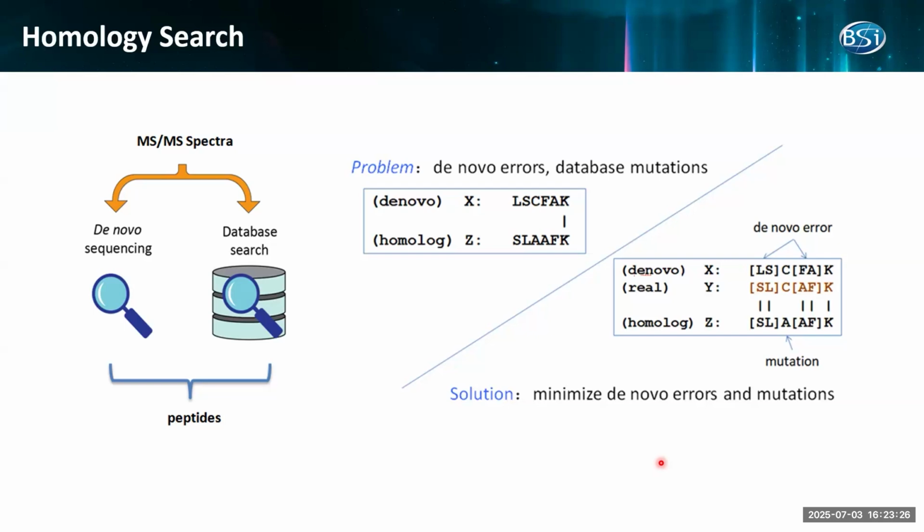Another issue is that DIA is very often very good for low abundant peptides, and now we search the canonical database more than sequence variant databases. In that case, some of the database may not be complete and can miss some information. Now, it's very important and necessary to take both pieces of information to get a good, true peptide sequence result.